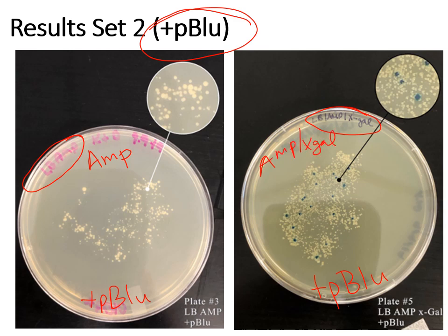And one of my former students, he did beautiful work in terms of lab reports and everything, and so he made this lovely figure where they even zoom in so you can actually get a better, closer look at the colonies, and you can see the difference between what this growth on the left looks like versus this growth on the right, and what you are seeing scattered throughout that growth, okay?